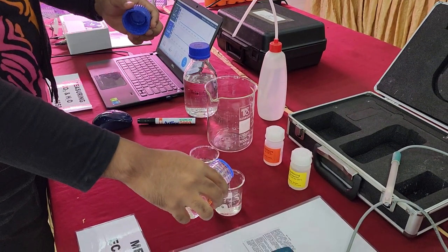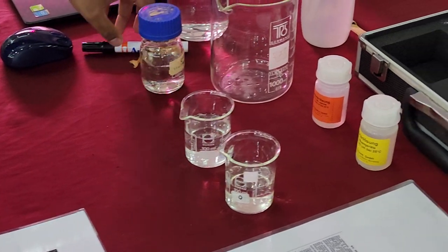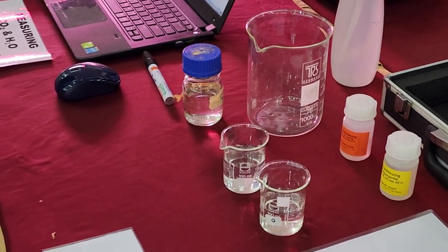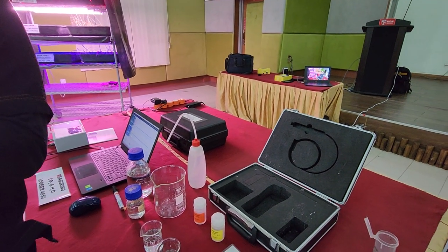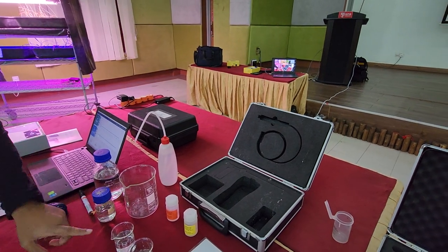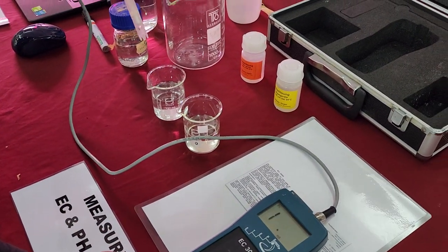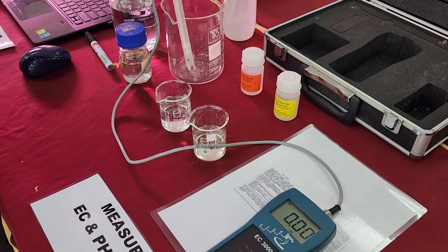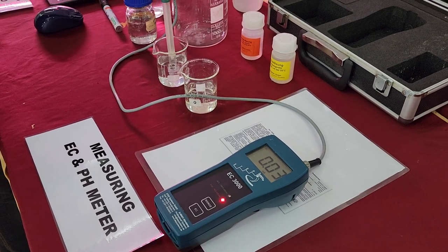Alright. Before we test the EC, whose EC do you think is going to be lower or higher? This one here is distilled water. Do you think it's going to be higher or lower than the pond water? Lower. Why? Because it's got no charge. Okay, let's see. So distilled water, pond water. Let's see the EC for this water, and what unit is that?